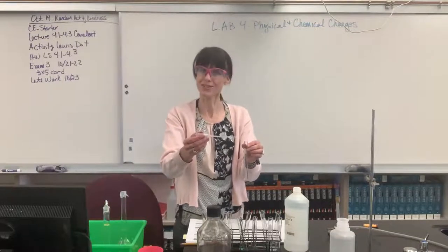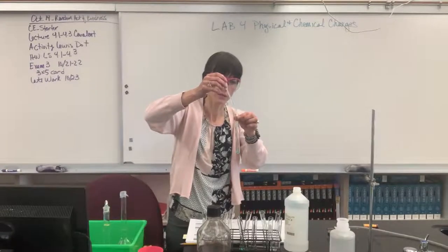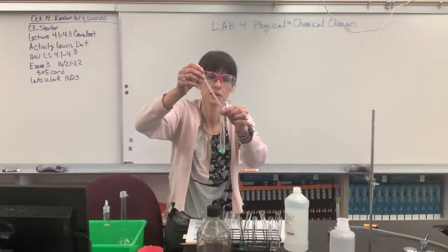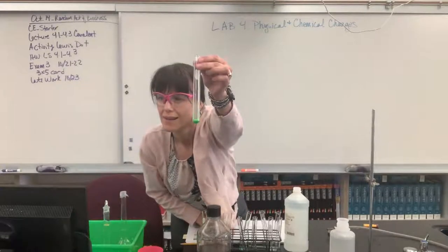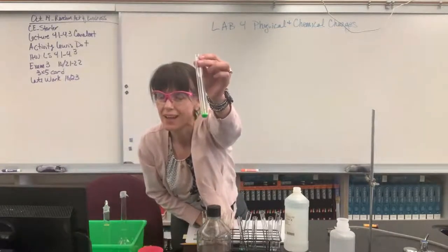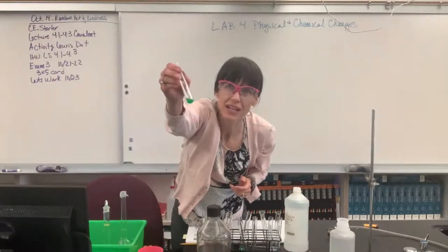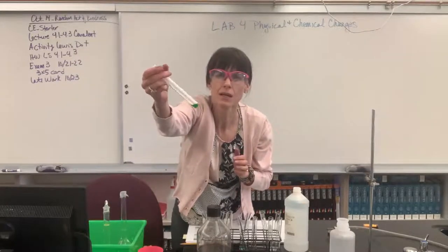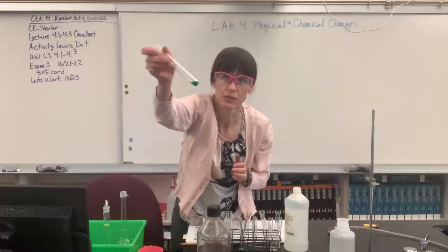The molar just means concentration. We'll talk more about that later in the year. Here we go. 1, 2, 3. Okay, that was 15. I'm hoping you can hear that. It's fizzing. And look at that green, completely liquid. And it was fizzing. Yeah, definitely reacted. Beautiful green color.